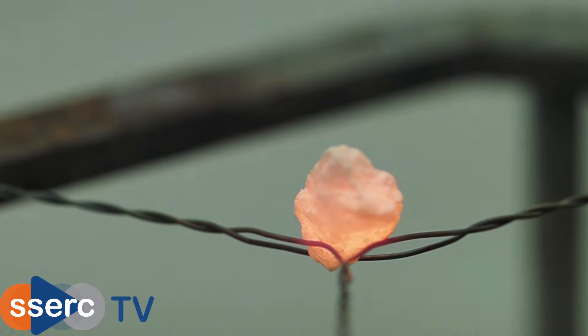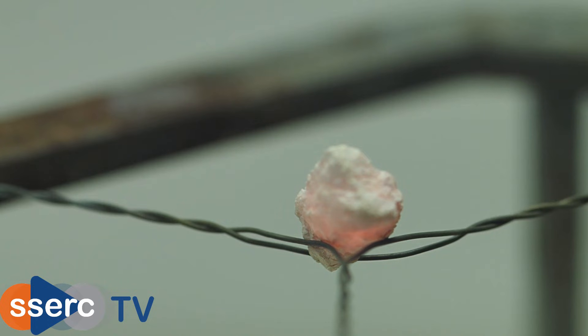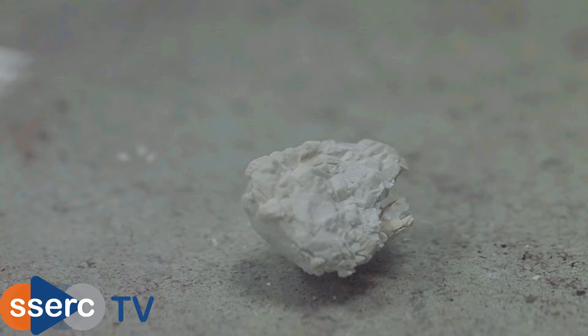After about 10 minutes turn off the heat and allow the marble chip to cool. If you look carefully you will see that it looks a little bit different. It's less shiny and if you handle it you will find that it is now quite crumbly.